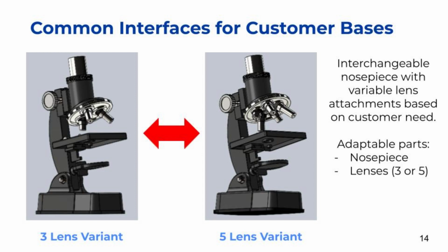Two variants of the microscope are shown to illustrate the common interfaces of the design. The 3-lens and 5-lens variants use common interfaces to the optical structure while changing the number of lenses and types of lenses between the two identified customer bases.